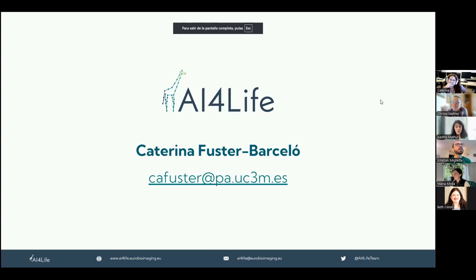So I will continue. Here someone asked, can you ask the chatbot for more complex things, like giving the average size of all the segmented cells, the average intensity, or other kinds of measurements, I imagine? Yes, I have tested this and you can do it. Cool.